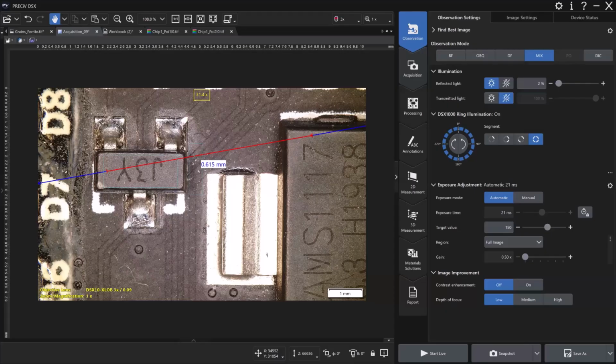Most customers have their own internal requirements for calibration verification check frequency. You're not going to actually recalibrate the microscope, because the only time the microscope calibration would change is if you physically move the microscope, and it could cause calibration to vary because you've moved it, or you've damaged an objective or something like that. Or if they disconnect components on the microscope, or change out the objectives, then they'd have to redo calibration.